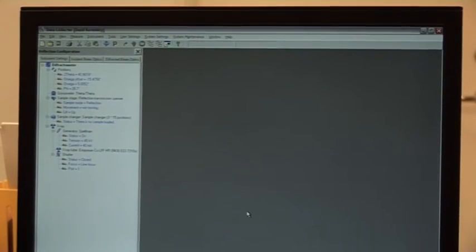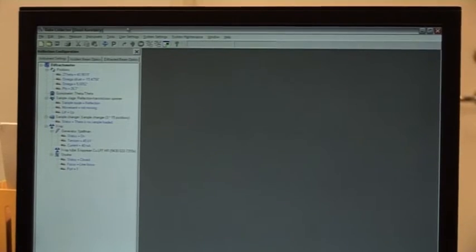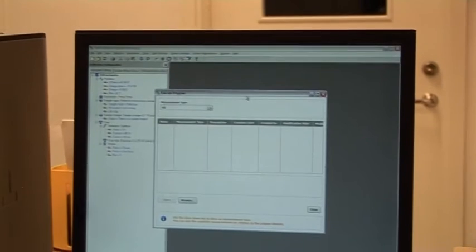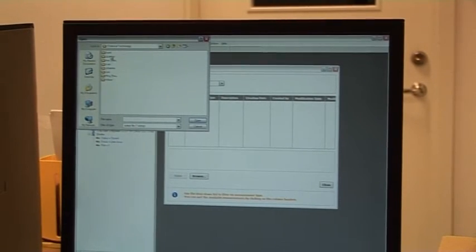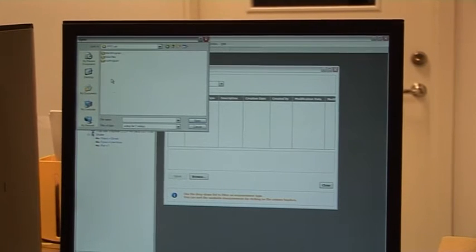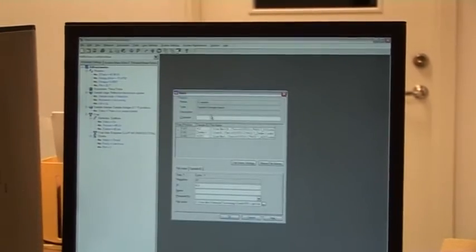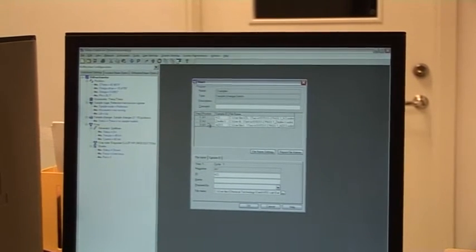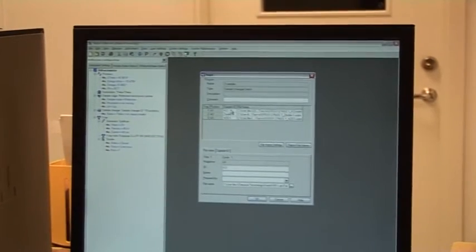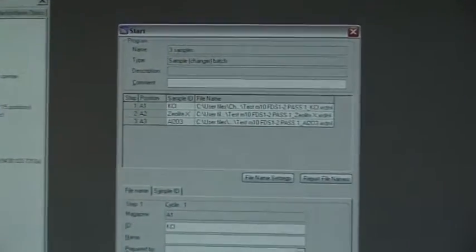That's a batch program. You can just give a very general name like three samples. So now we have created the program for running the machine. Then it's just to run it. We go to measure and pick our program. We have to pick now our batch program for the sample changer. Then we have position A1, A2, A3, that looks correct. Sample name also looks quite correct. Then we click OK.